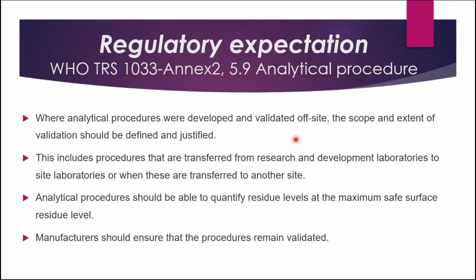ये केस में आपको क्या validate करना है, you have to define and that should be analytical method validation for cleaning validation should be routed through the predefined protocol. Analytical procedure should be able to quantify residue levels at the maximum safe surface residue levels.